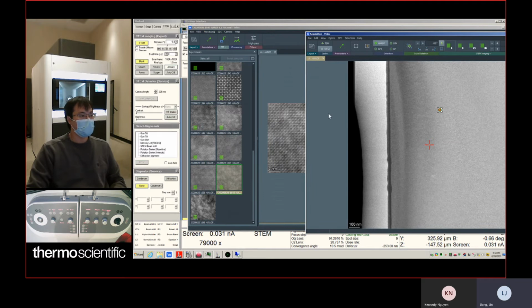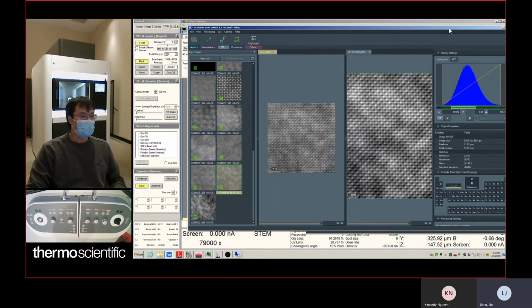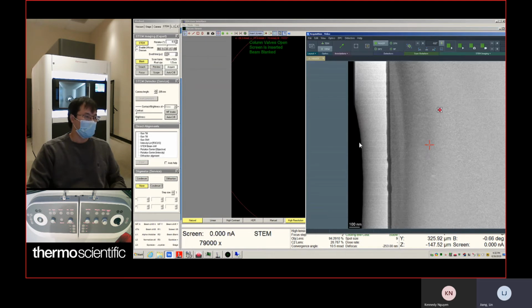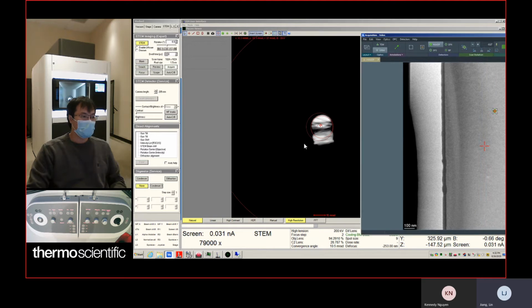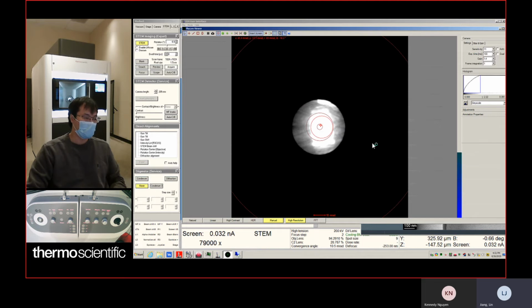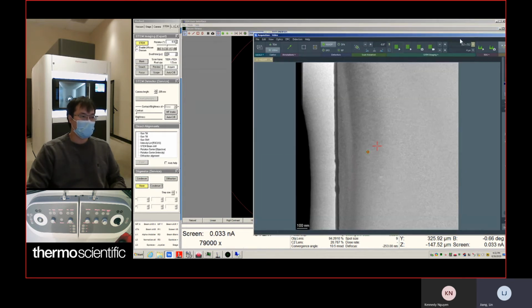So this is how we tilt the sample to the zone. Basically, if you keep turning it off, you might have a hard time finding the crossover. In this case, for example here, you cannot find the crossover because it's way off. If you increase contrast, you feel it's on the right, but it's not. So you can do two things.